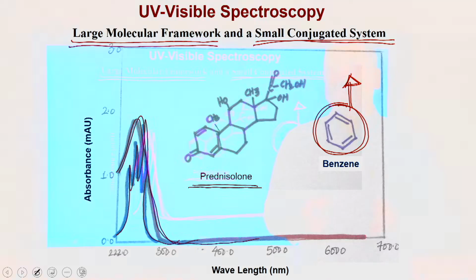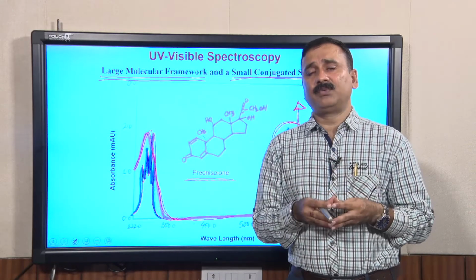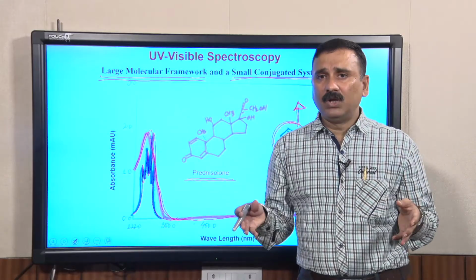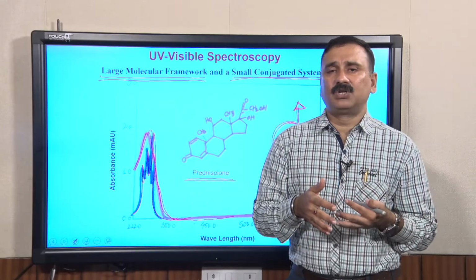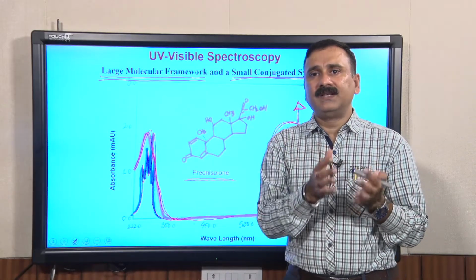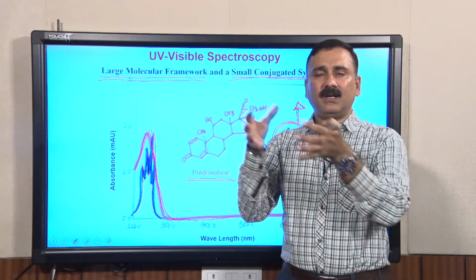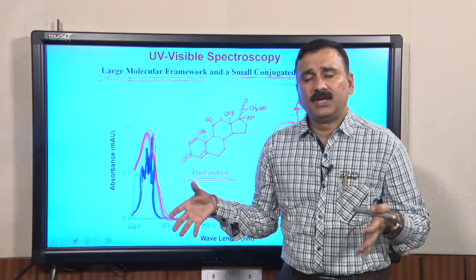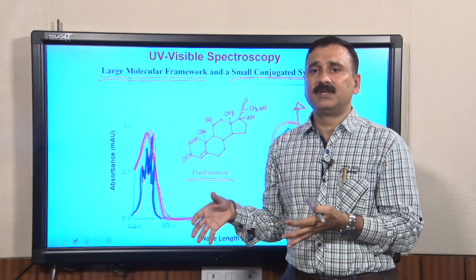So, with this we would like to emphasize the point that if you collect the absorption spectra of a molecule, and you are expecting a change in the structure or in the presence of functional groups, or a change in structure in terms of a single conjugated ring versus a double or triple conjugated ring, you are definitely going to see a change in the absorption spectra.